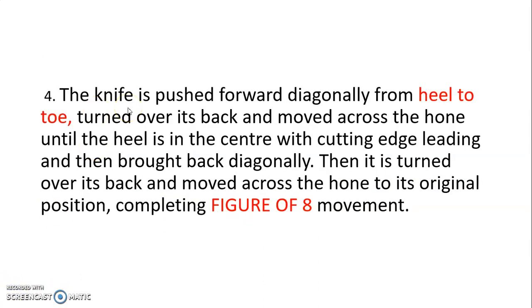The knife is then pushed forward diagonally from heel to toe, turned over its back, and moved across the hone until the heel is in the center with the cutting edge leading, and then brought back diagonally. It is then turned over its back and moved across the hone to its original position, completing the figure-of-8 movement. This is the honing technique.